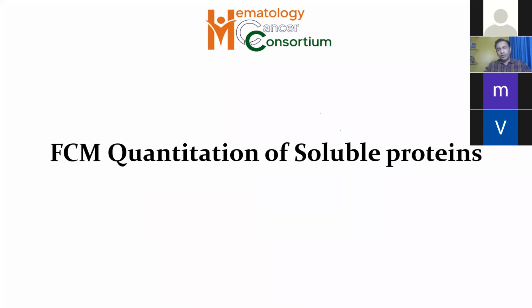Then also, now recently, this is my last couple of slides. Recently, we have seen in the COVID situation, interleukin 6 got very much importance. In fact, cytokines, but interleukins particularly. Now we evaluate by ELISA, but ELISA is not everywhere available. So we can also do it by flow cytometry. We have standardized it in our lab.